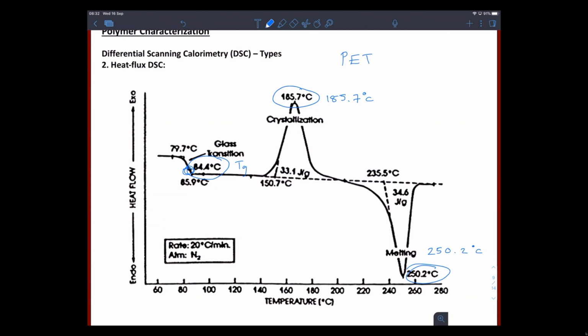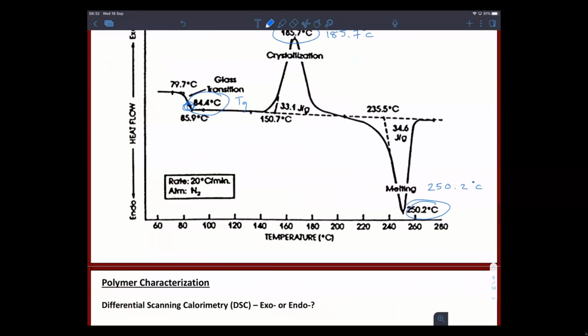So what they were able to show actually in the Mettler Toledo video was that what they measured from PET and plastic bottles was very similar to the reported values. So they knew that their instrument that they were developing was working correctly based on the interpretation in there. You see a lot of these, but this is really just to get this into your head, what's going on.